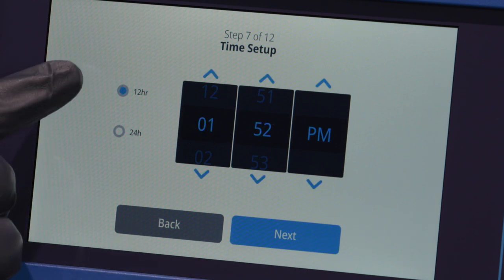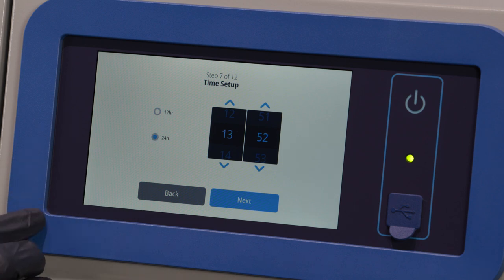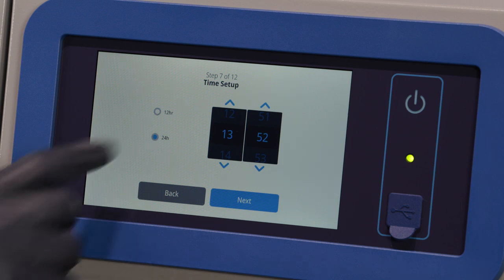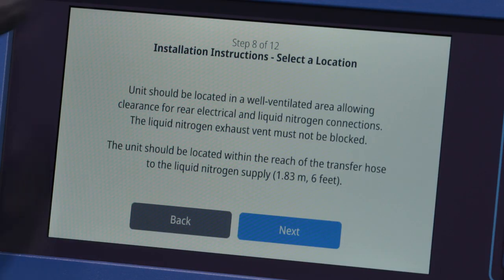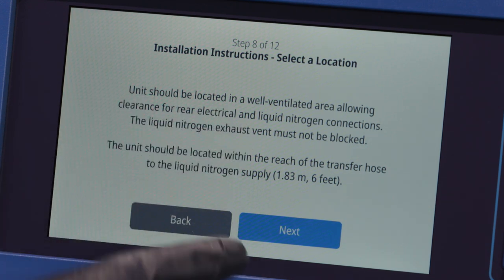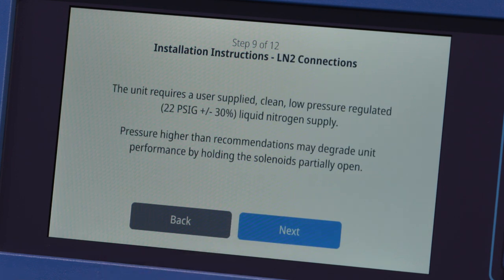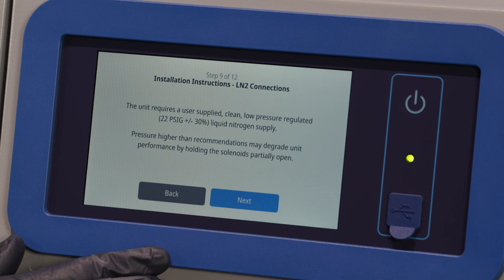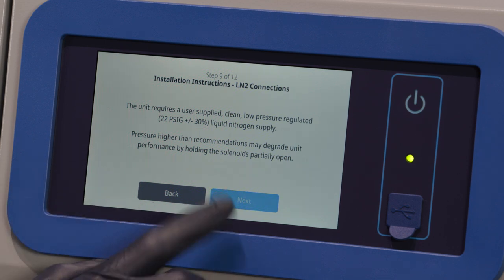The next screen will allow you to set up the time. Select the preferred time format, either a 12-hour or 24-hour format. Once the intended time is selected, press the Next button. The following screens provide installation instructions. The first screen provides information about selection of location where the unit should be placed. Press Next after reviewing. The second screen provides information regarding LN2 connections. Press the Next button after reviewing.